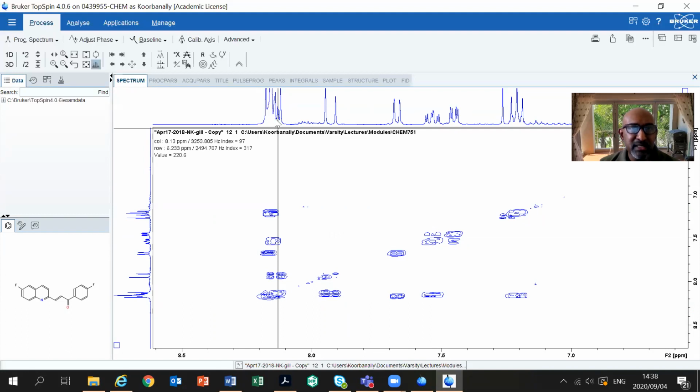But if all the other peaks disappeared, I would very easily see a nice double doublet for this proton here. That double doublet would be very similar to how this looks. It might be slightly higher, I think, from experience. This fluorine couples this proton with slightly higher coupling constants, but it would look exactly like how this peak looks here in this mess. But you can't see it because there are overlapping peaks here.